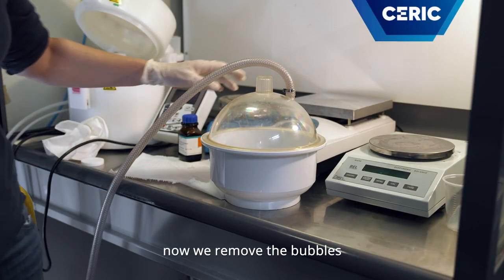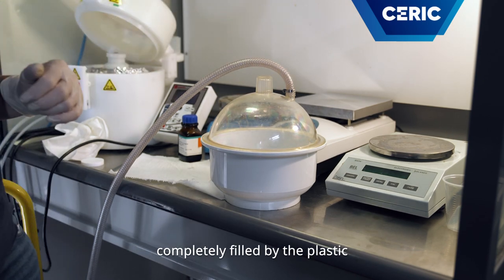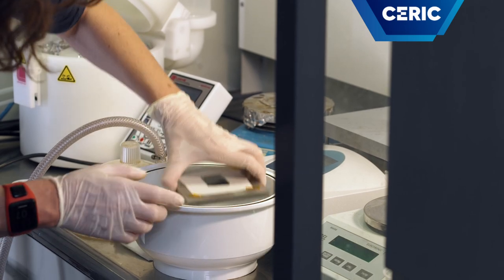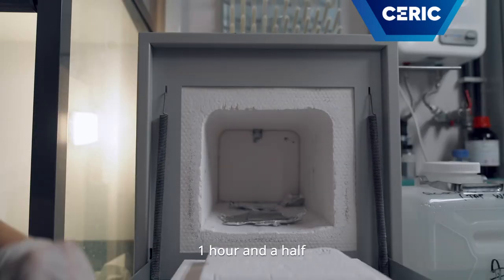Now we remove the bubbles in order to have the structures completely filled by the plastic. Now that we have degassed the material, we can put it in the oven to cook for one hour to one hour and a half.